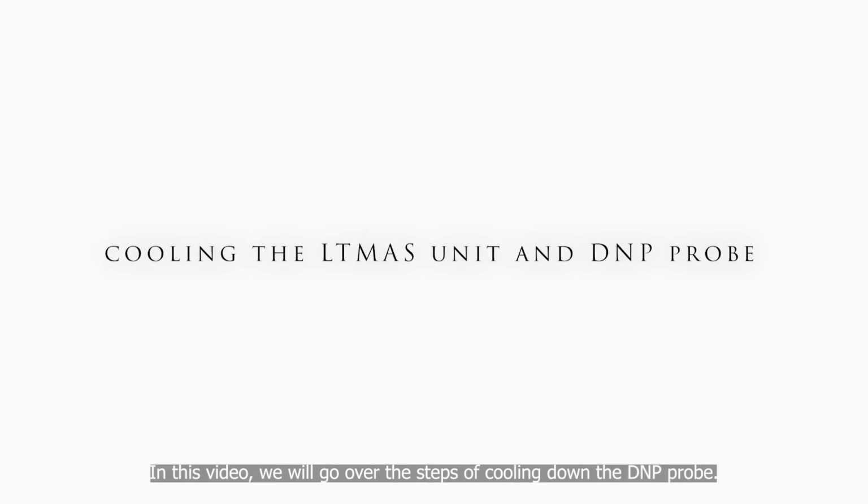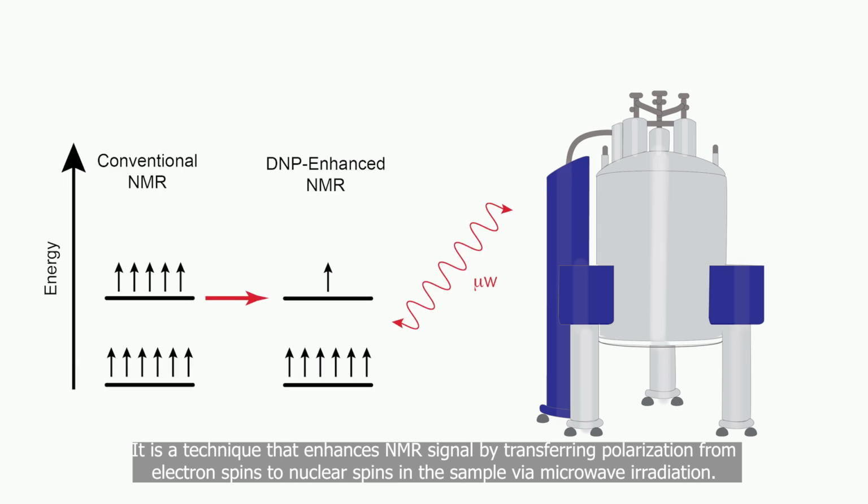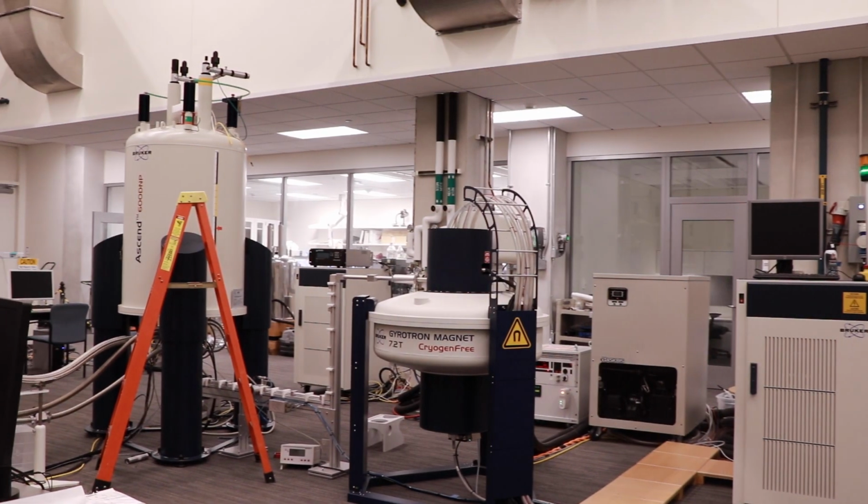In this video, we will go over the steps of cooling down the DNP probe. DNP stands for Dynamic Nuclear Polarization. It is a technique that enhances NMR signal by transferring polarization from electron spins to nuclear spins in a sample via microwave radiation. This results in higher nuclear polarization, which translates to increased NMR sensitivity.